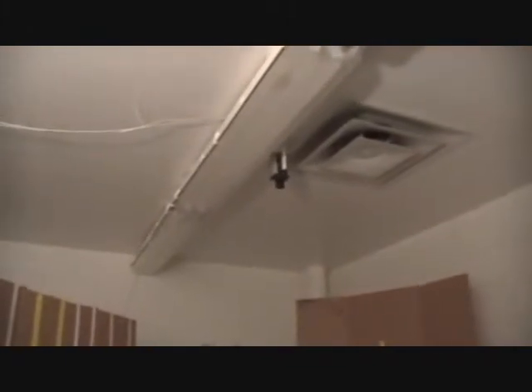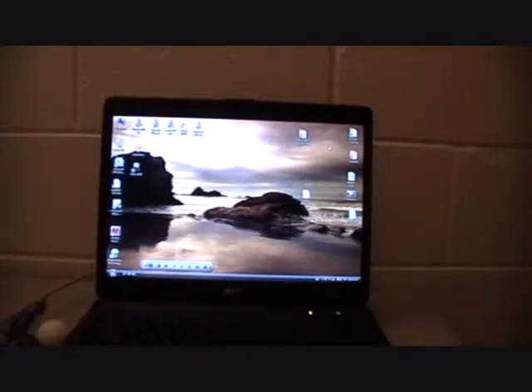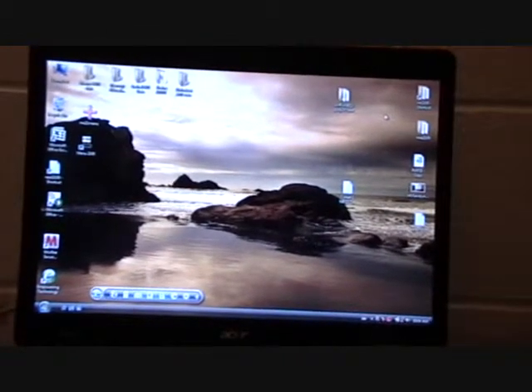And so these are the cues for our water maze. And if you look, we have our tracking camera up on the ceiling and the cables running across, all nice and tight. And we have our main light source in the corner. And then here is our laptop with our HVS software. And what I'll do is just run through our main setup detection for the Maze 2100.